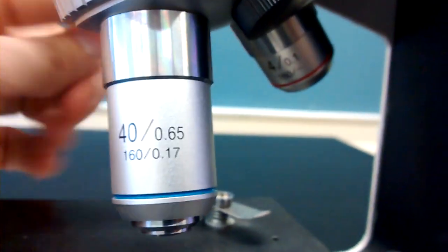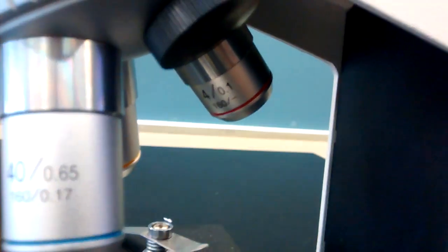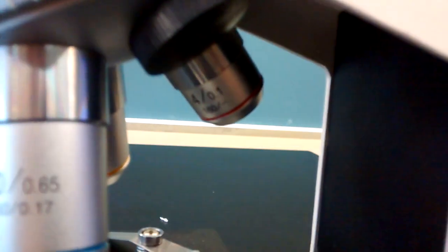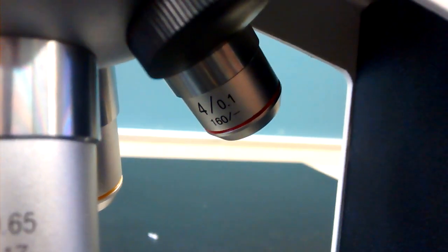This small one here with the red band is called our scanning objective lens. That first number there is a 4. And that means that will magnify all by itself four times.